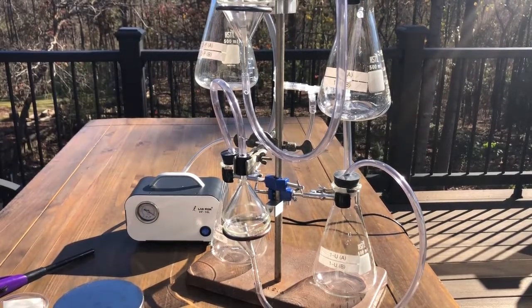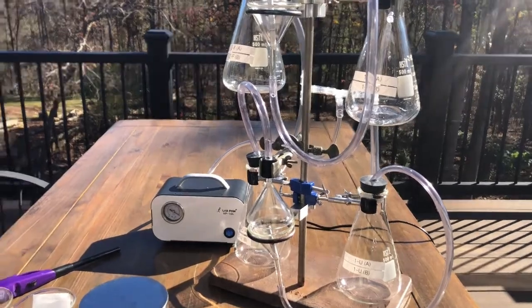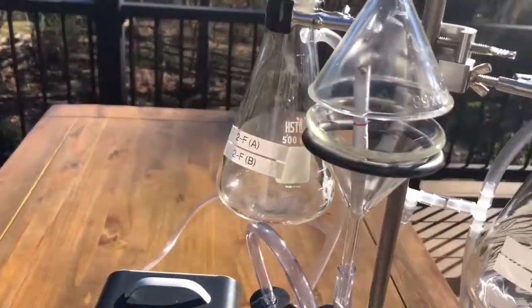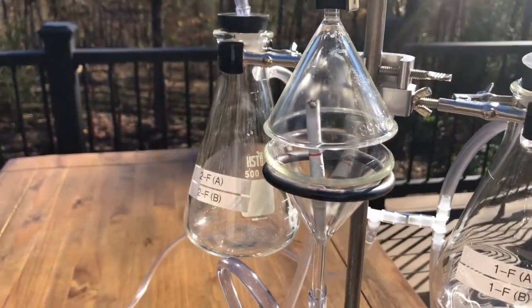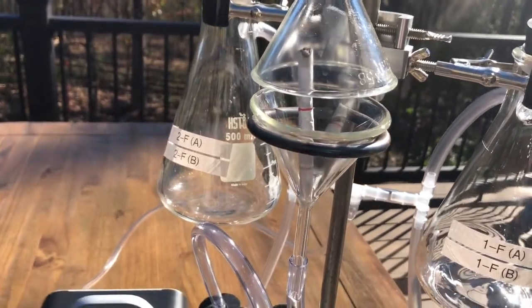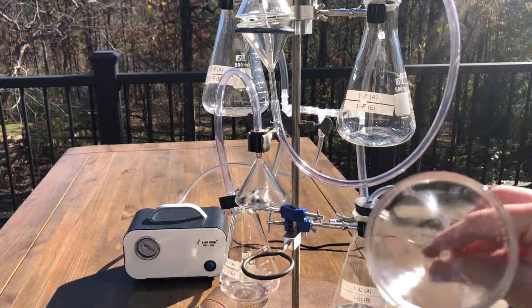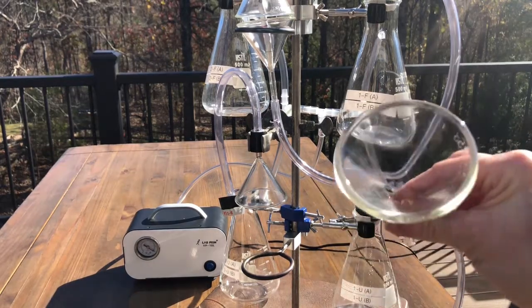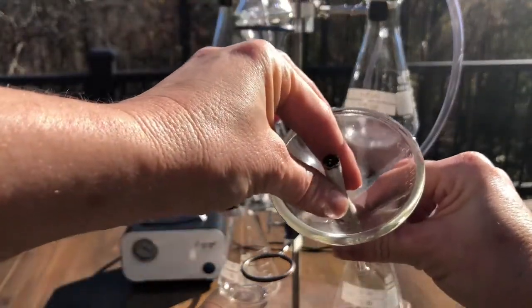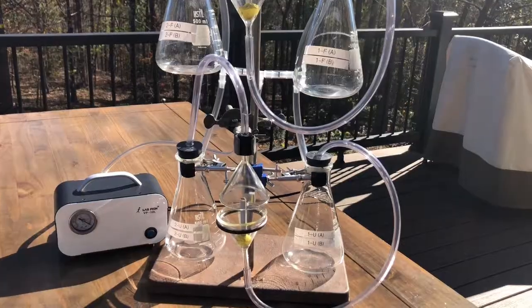And there they go. Here's a close-up. Ugh, they smell awful. Not only are they cigarettes, they're the cheapest cigarettes I could find, so they really do smell awful. So an issue we're experiencing is that the funnel is really narrow and the cigarette isn't getting a good enough seal, so I'm gonna do a little rigging.